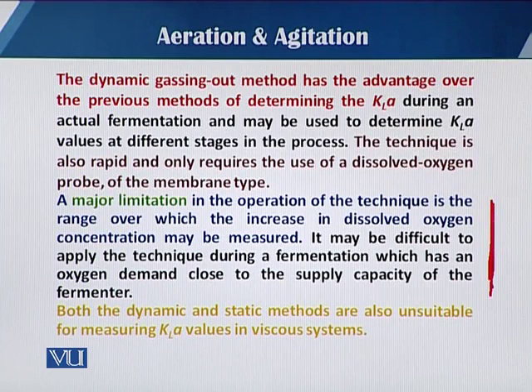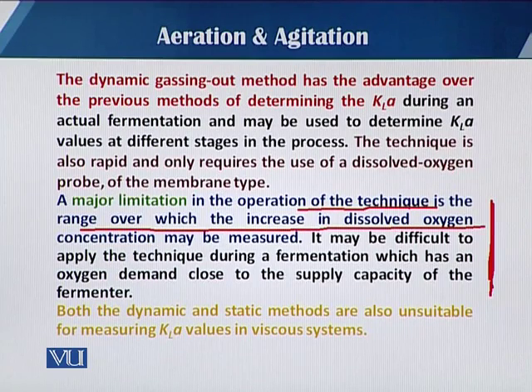So it may be difficult to apply the technique during a fermentation which has an oxygen demand close to the supply capacity of the fermenter.